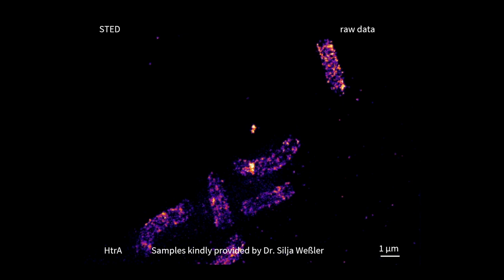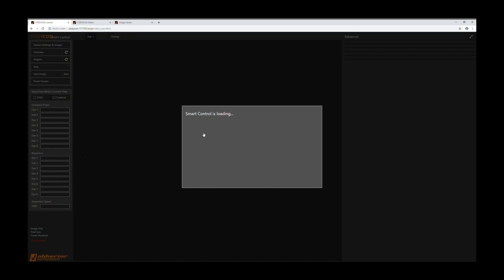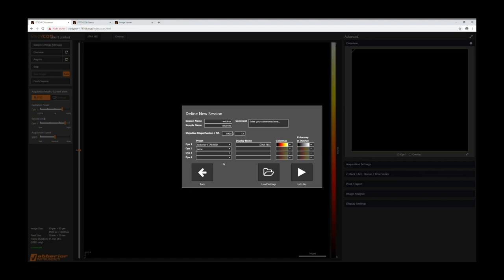We would like to show you a video on how to actually acquire a STED image in the STEDYCON. If you want to image in the STEDYCON, you go to the welcome screen, click on Start New Session, and then you are asked to define your session. You can put in your session name — all your files will be saved under today's date in that session folder — plus a sample name which is how your images will be saved. Then you choose your dye settings, in this case STAR Red and Alexa 594, and set display names and color maps. When everything is set, you just click Let's Go.